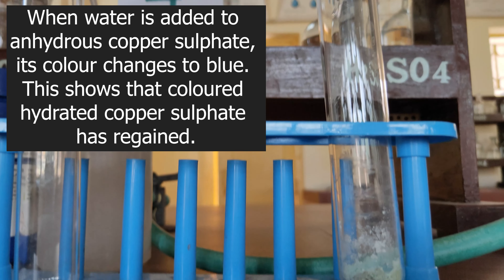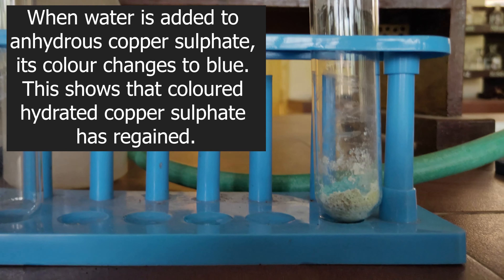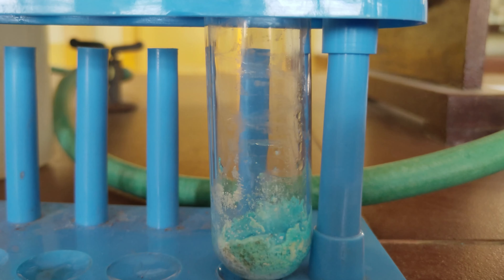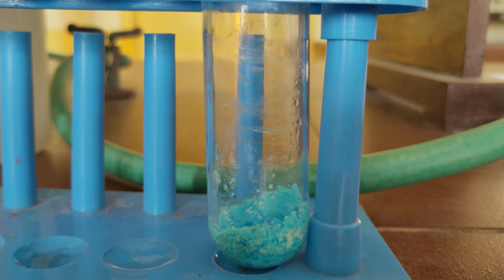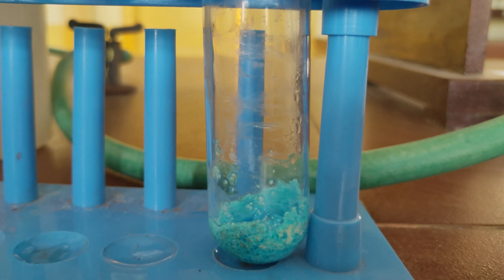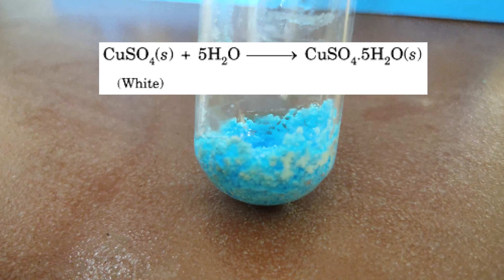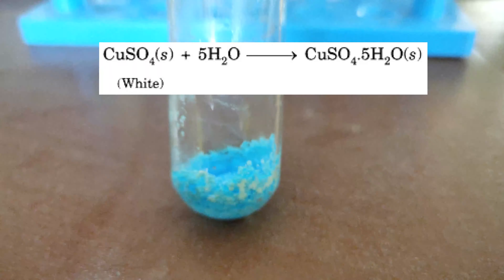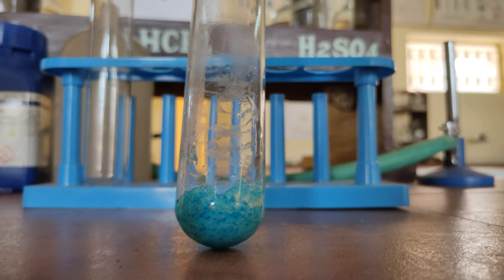Remove the boiling tube from the flame and cool it for some time. Using a dropper, take a small quantity of distilled water and add two to three drops into the boiling tube containing the anhydrous copper sulphate obtained after heating. The white copper sulphate turns blue, indicating that the blue coloured hydrated copper sulphate is regenerated. So this reaction is a reversible chemical change.